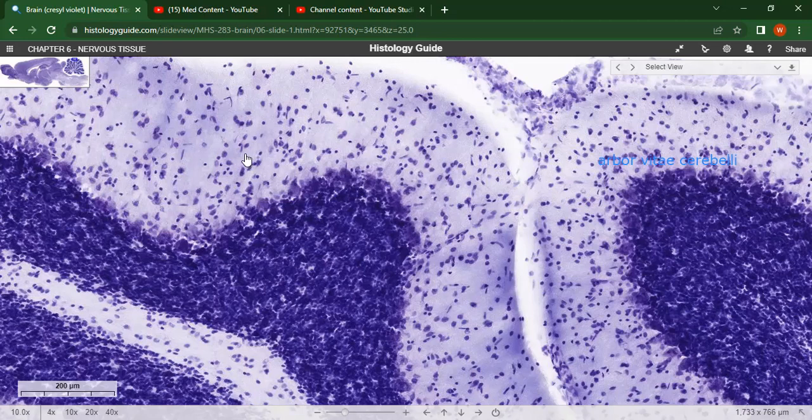You have to believe there are basket cells and some stellate cells. So the outer molecular layer is mainly composed of the dendritic arborization of the Purkinje cells with a few basket and stellate cells. Also, in the outer molecular layer is the synapse between the climbing fibers and the dendrites of the Purkinje cells.